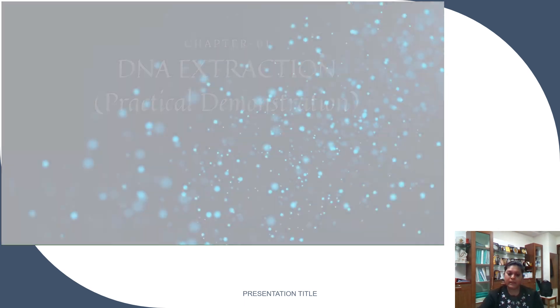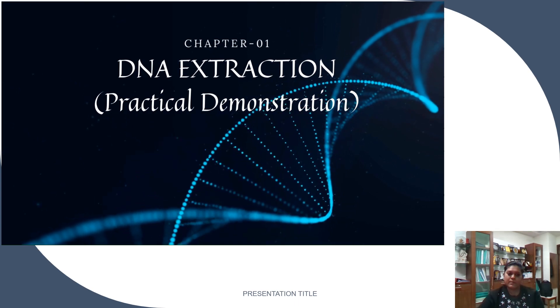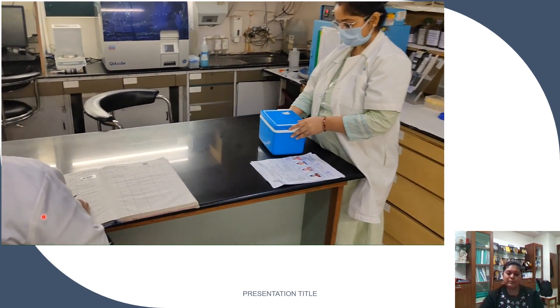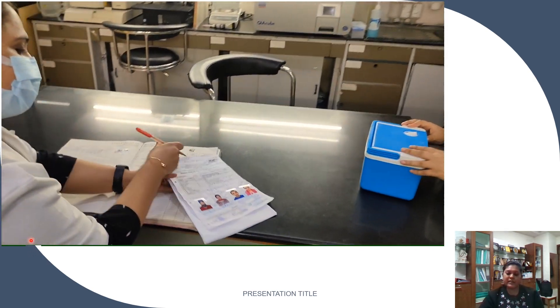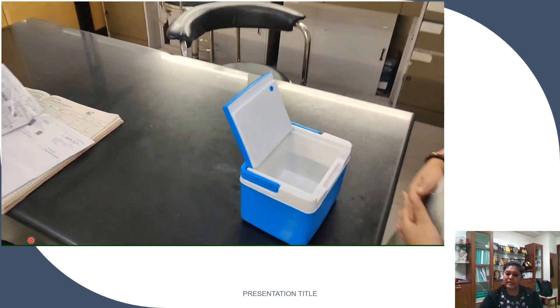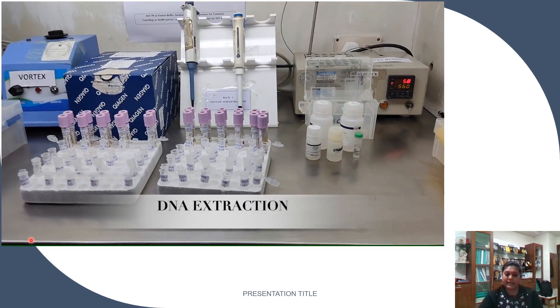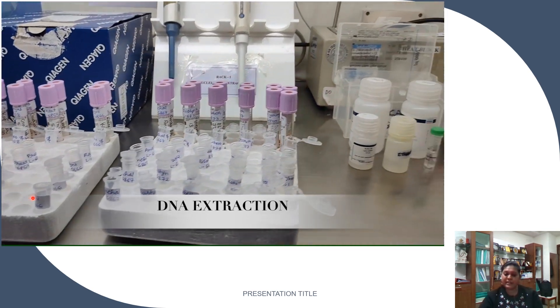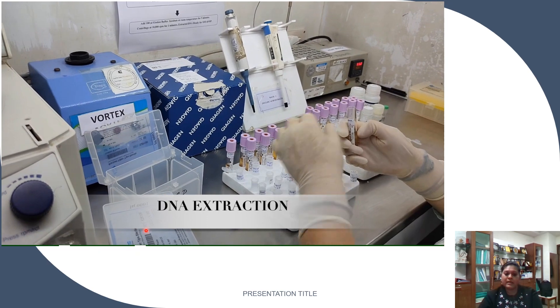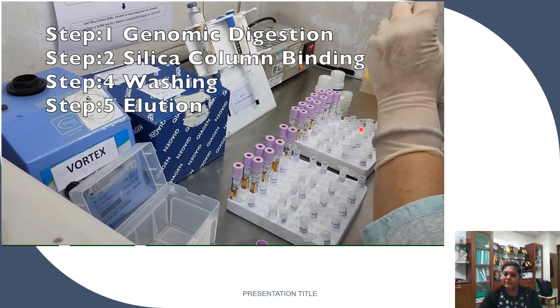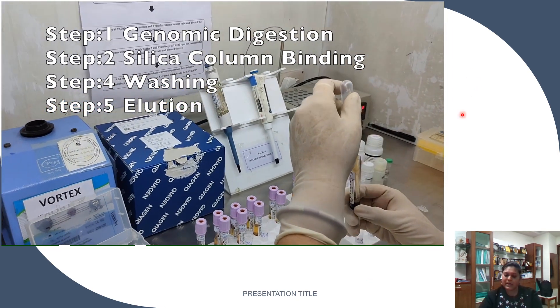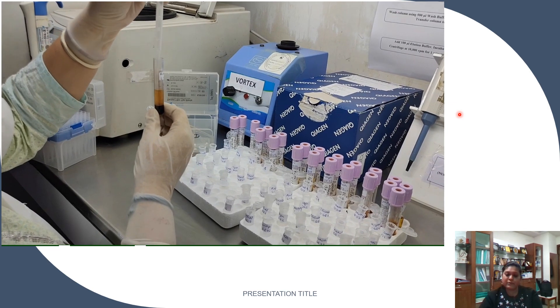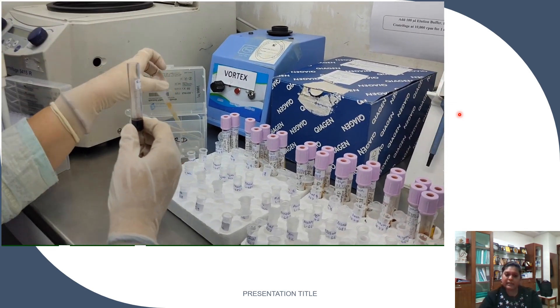For this practical demonstration, we'll perform extraction using a whole blood sample. As soon as we receive the sample in the laboratory, data entry is done and a specific lab ID is allocated to each sample. We then move to the DNA extraction area. The setup includes the Qiagen kit, a vortex mixer, and a centrifuge. We use EDTA tubes for the sample. We start by removing the plasma, and then extract the buffy coat, which is added to the first eppendorf tube.